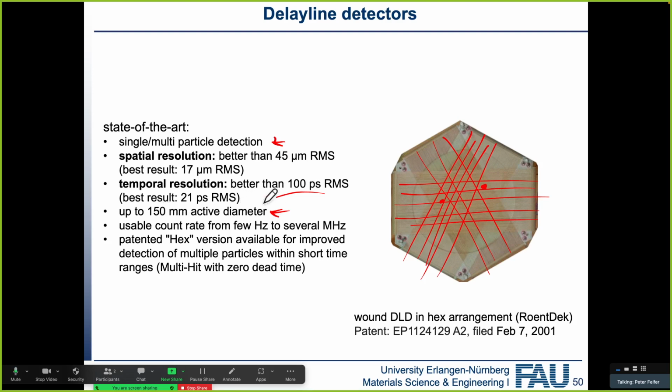And so typically we only use up to 80 millimeters because that's the largest way to get the funnel type MCPs. I know the colleagues in Stuttgart, for example, use detectors up to 120 millimeters. We can certainly go up. And nowadays there's some MCP manufacturers that can make capillary MCPs, the typical new type, up to 20 centimeters. Yes, you can make larger and larger detectors.